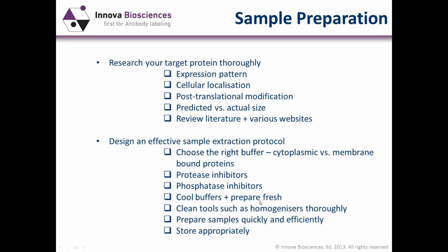And again, one of the things I would recommend is always to prepare your buffers fresh. I never once used any buffers unless they had been prepared fresh on that day, and also to have all your buffers cool and prepared. It's pointless having them at room temperature and then putting the cells in this type of buffer, because as the temperature increases, the more likelihood of your proteins being degraded.